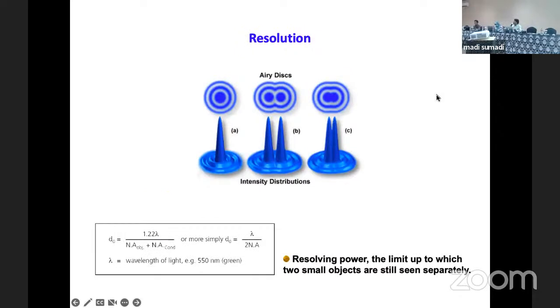So the very important point comes: the resolution. I think you're all aware of mobile phones, and you have a nice pixel count, and yet from some distance you cannot get a nice magnification just because it's not sufficient. So from the scientific point of view, when you talk about resolution, it means the particles or structures that you are able to resolve very clearly. That is the resolution. So you see here, these two structures we can clearly resolve, and here is only one structure, only one dot. And here you have very close-by structures, but you cannot resolve them.